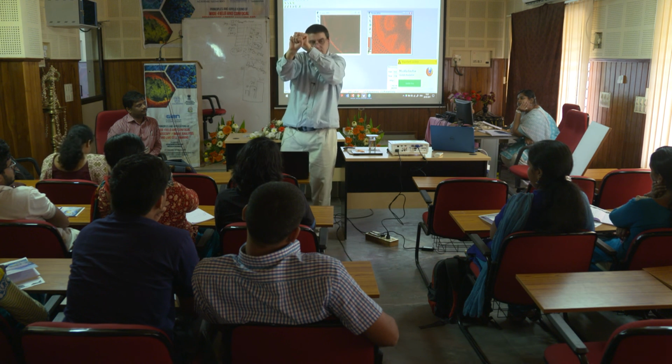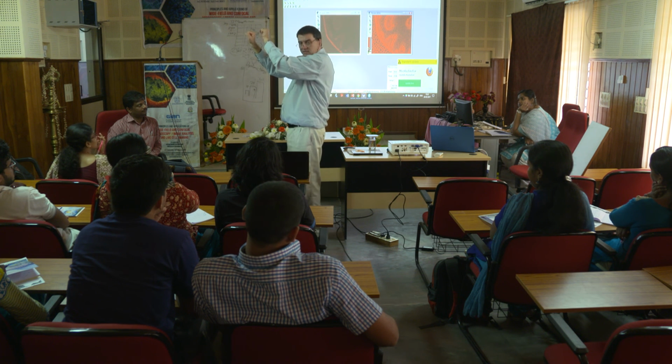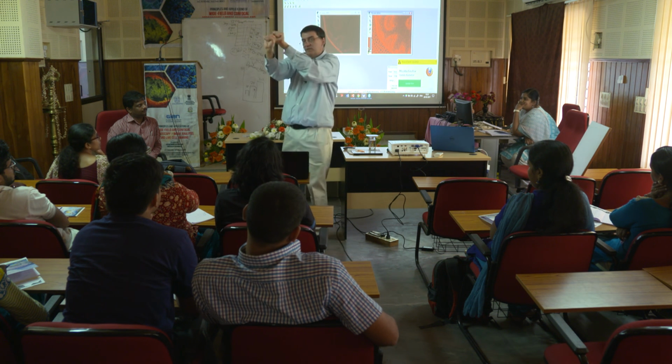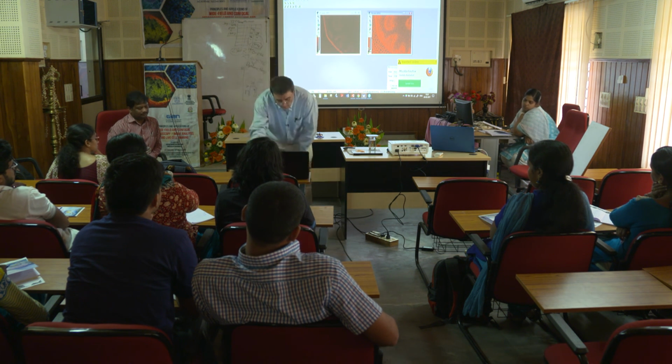But in reality, with the confocal, where you can look at it in 3D, you'd realize they're not. But in a wide field, you'd see it this way, and you'd say they are. Okay, so co-localization.